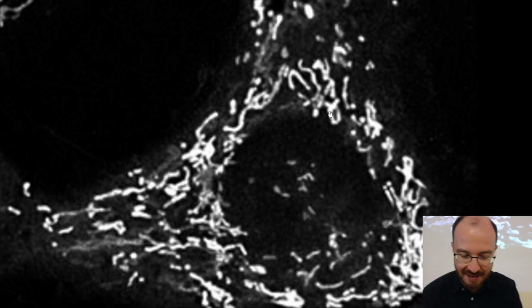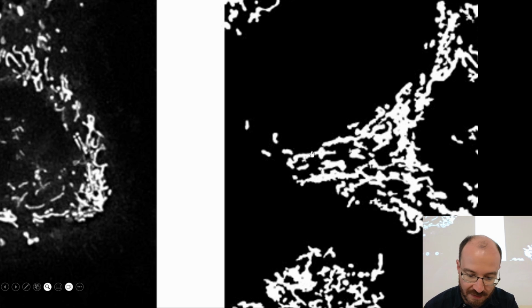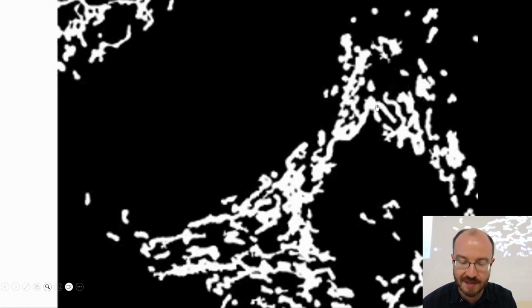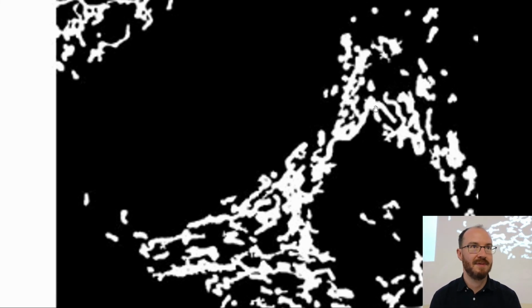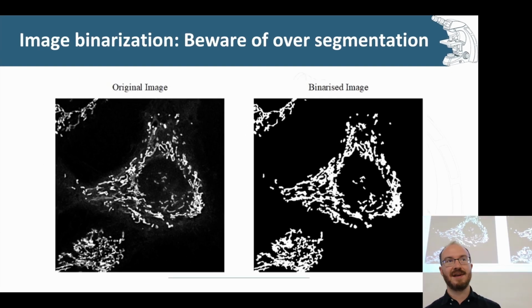So just to show you this relatively poor segmentation result, here I've met the one objective, great, that strand is continuous, but those two structures have now become fused. So now I'm going to get wrong results as to where the fusion happened or not. So segmentation is a really, really challenging task, especially for things like this where the actual nuance of touching or not touching makes a massive difference.